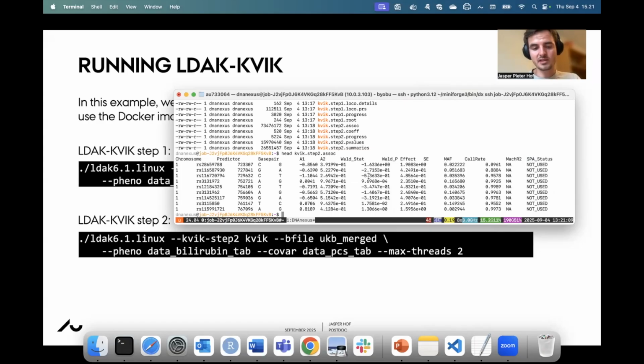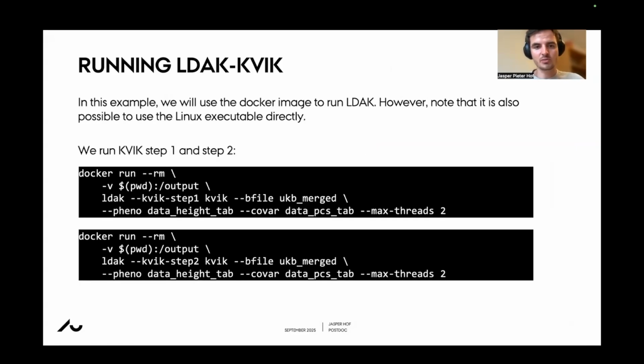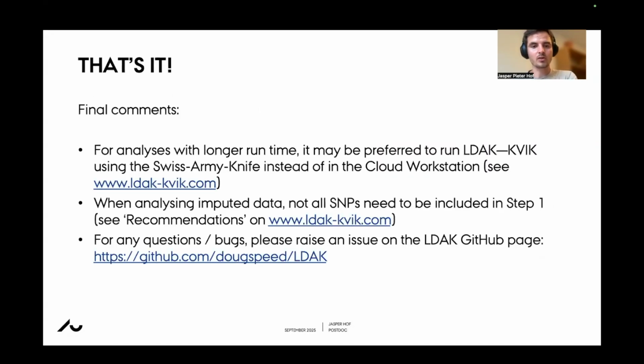So yeah, this was how to perform LDAK-KVIK on the UK Biobank research analysis platform. We've here used the Linux executable, but similarly, it's possible to use the Docker image to run LDAK. So I've just included the commands right here. I'll also be posting the commands that I've used here in the comments or on GitHub, so that you're able to replicate these steps. I hope you found it useful, and I'll just add some final comments.